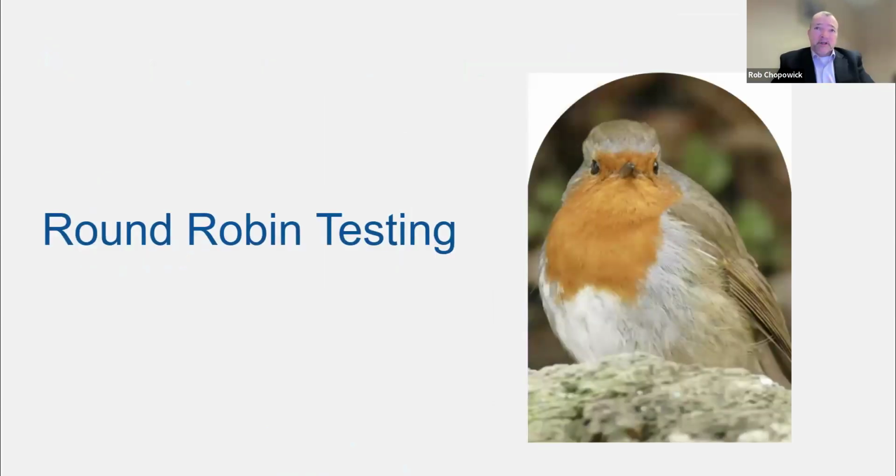So we had the propylene testing come in, and we didn't have any research on it. Now IPA, we had the research project 1573, but propylene not so much. So the committee agreed to do round robin testing. What that meant was we had the ejector and we had propylene gas, and we went around to all the committee members, and if they had a lab or access to a lab, we did the testing ourselves. The results were positive, and the correlations with sulfur hexafluoride were surprisingly good. Problem was, even though we were testing it, it just wasn't a robust enough testing process. So more testing is needed, more validation is needed. So although we were enthusiastic about it, when we got to the end, we realized it just wasn't defensible enough in terms of research, like the way the IPA research had been done and how much better from a defensible point of view the IPA research really was.